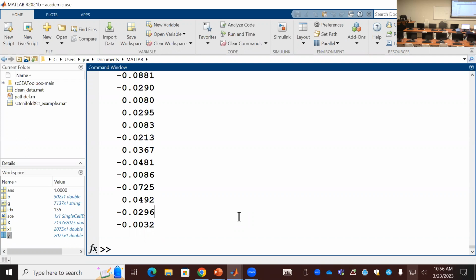Yeah, shut this down. You can close the original. You can start to work on this. This is the only macrophage. So you drag this away and close this. That's original. You don't use this. You start to work on the macrophage.